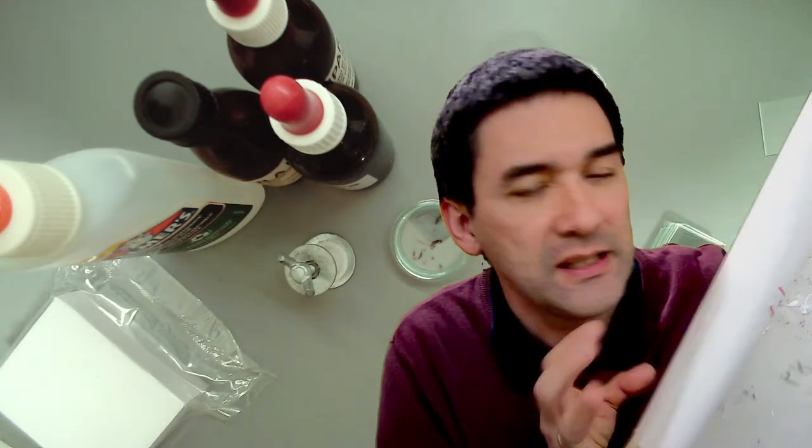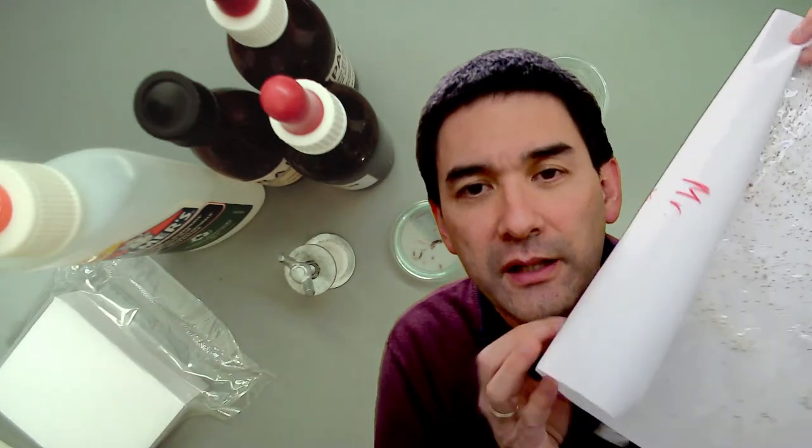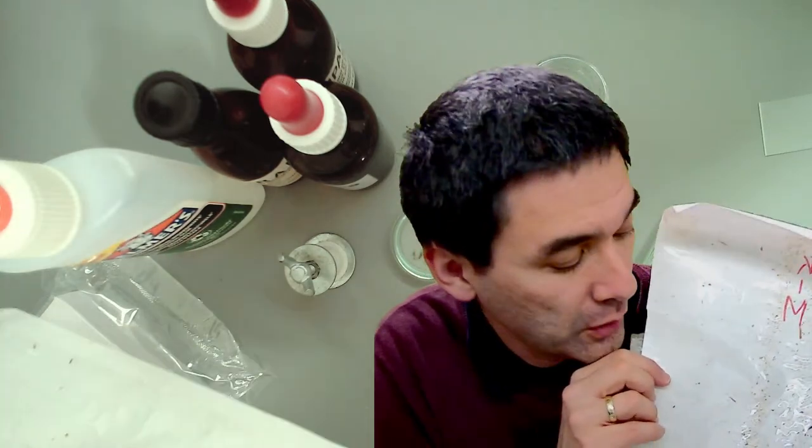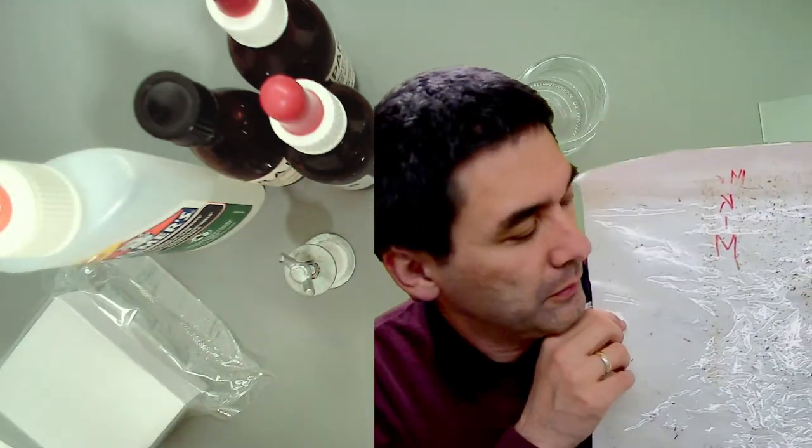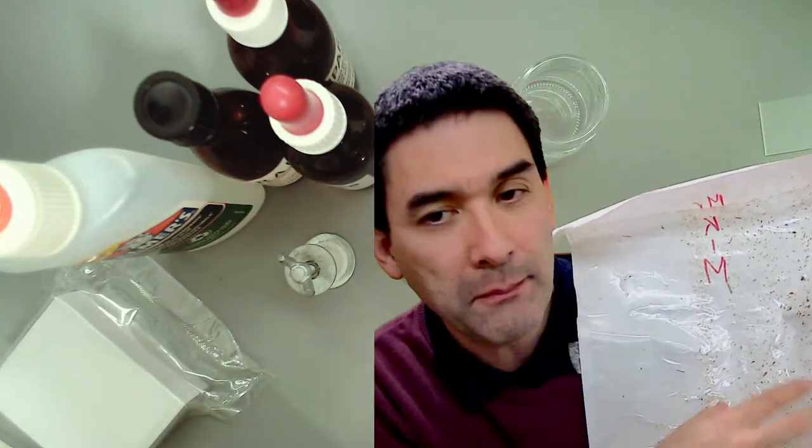And one of my former students, as a goodbye present, gave me something very, very unusual, something that looks like this. It's wrapped up paper. There is some sticky foil on here, and there are lots of dots on here. Some time ago I actually made a video of this on my other microscopy channel. But look at this: this paper is full of not only mites but also bee parts and a little bit of honey and so on.